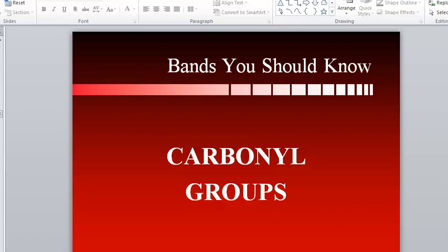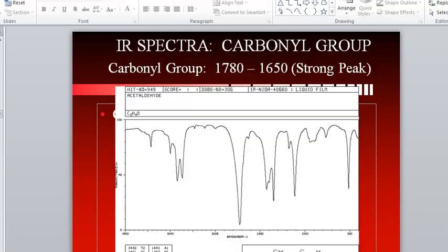Okay? So with the carbonyl functional group, what you would traditionally see in an infrared is something that looks like this. First off, I don't see an OH group. I know what an OH group looks like on an infrared: it comes down and comes back up, but I don't really see that signal here. So there's no OH group on this molecule. The next one we're going to talk about is carbonyl. And we now know that carbonyls happen at 1700.